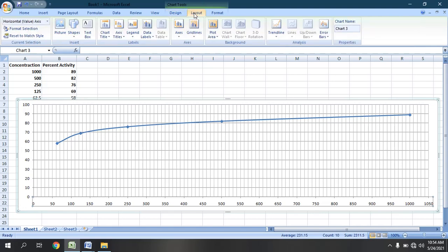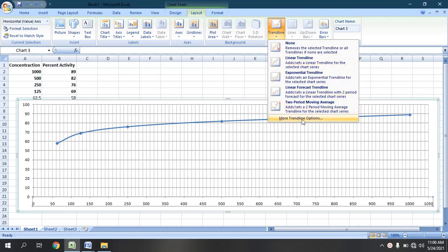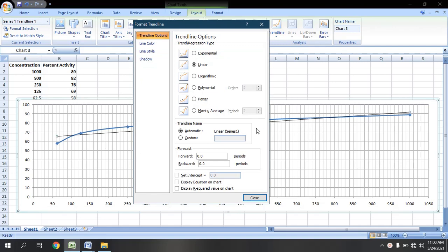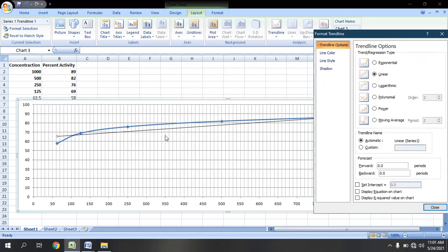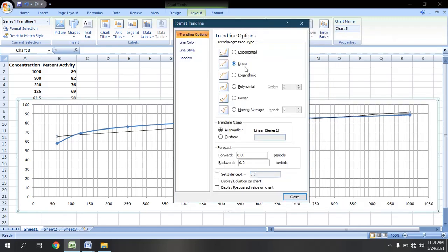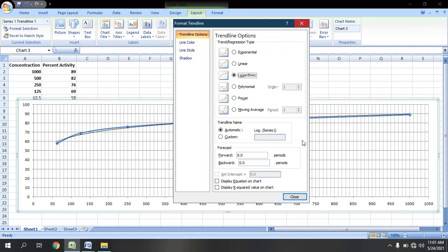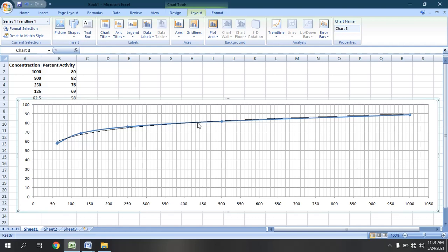We will go to Layout, then to Trend Line, then to More Trend Line Options. After going to More Trend Line Options, we will compare our data with different patterns. The linear option is selected first — we can see our data is not following the linear format. If we try exponential, our data is not following the exponential format either. Our data is also not following polynomial or power. Our data is resembling the logarithmic format — you can see the trend line closely matches our data.